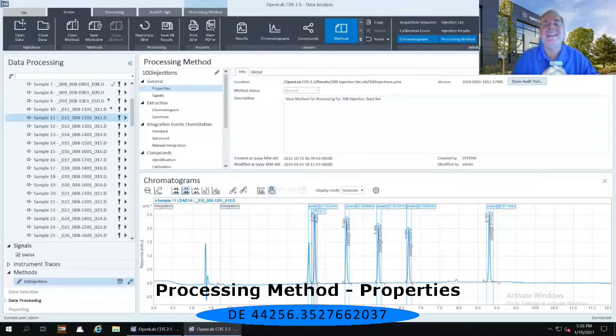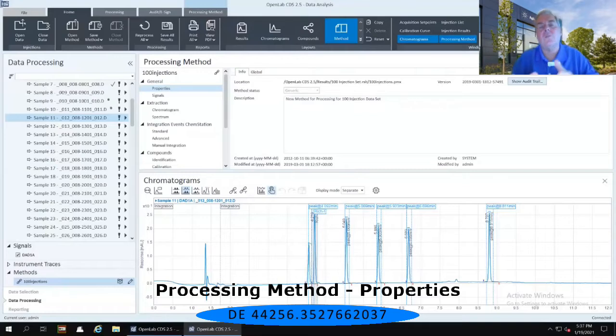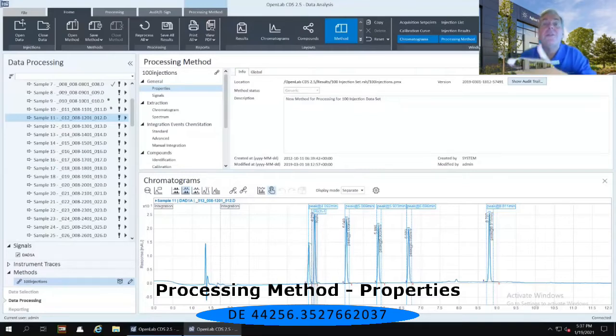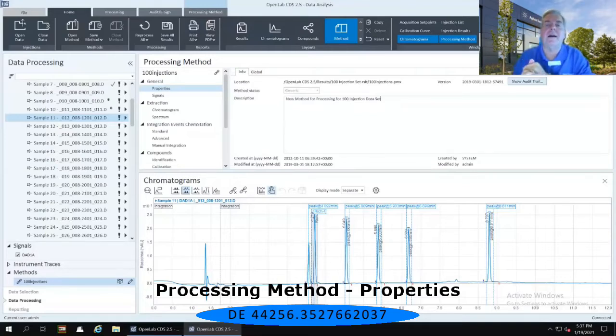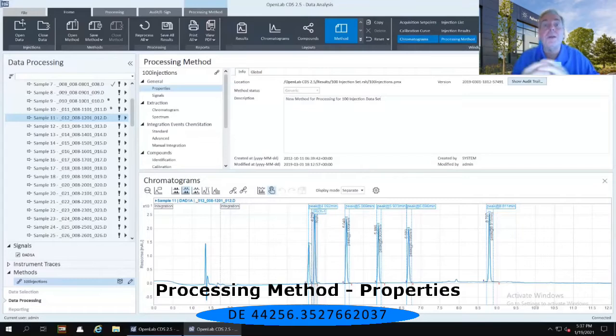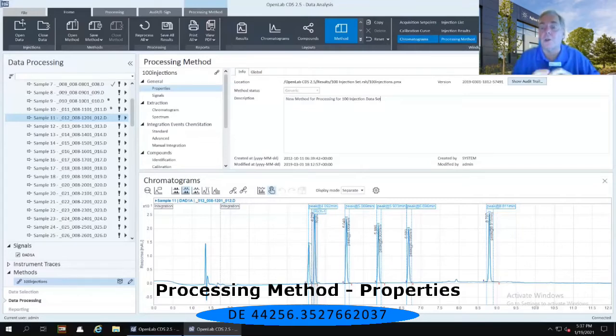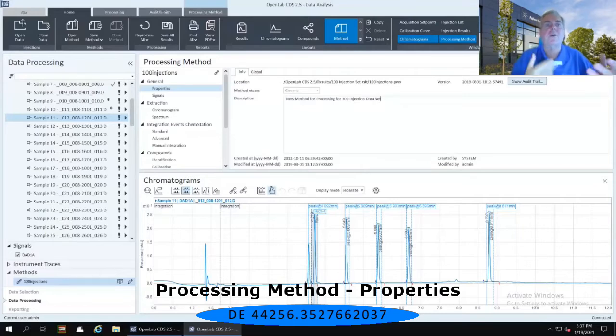Well, in the audit trail, it says that not only has my colleague taken over the offline version of that instrument, but also because they are connected together by one common executable, he's also taken over the online version of my currently running system.